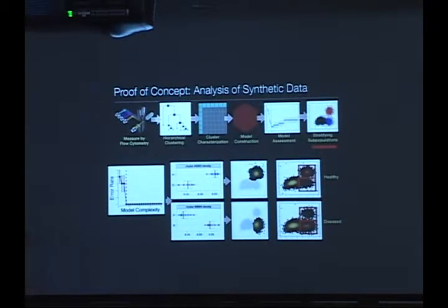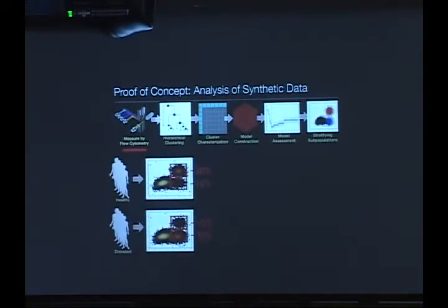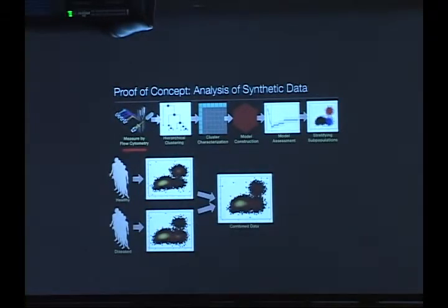But two slides back, when you showed the first step where you're pooling all of your patients' data together into one data set, those nodes that would come out as unique won't come out as unique if there's heterogeneity in your disease set, right? So you won't identify those areas to chase, is that right?